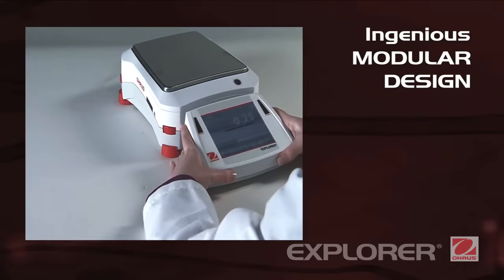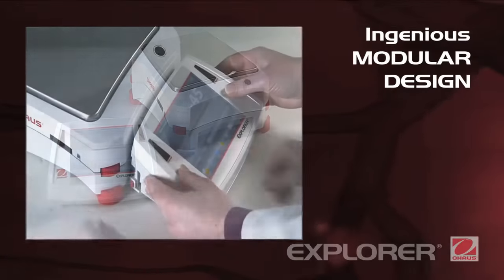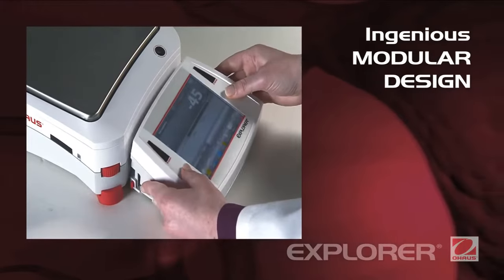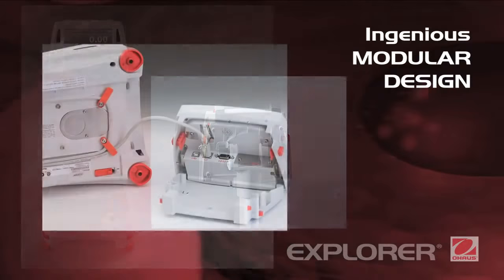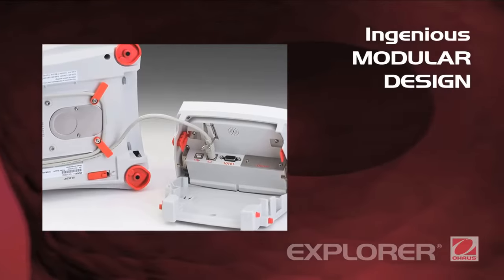Ingenious modular design. Explorer's modular design features a color touch display that can be separated from the weighing base. The display can be adjusted for optimal viewing, or mounted on the wall, or on its optional tower accessory. A robust die-cast metal base features an integrated cable storage system.